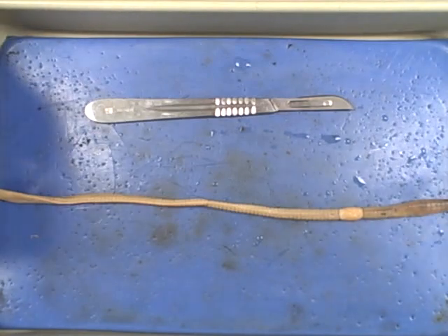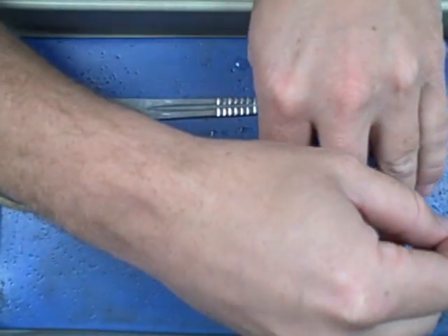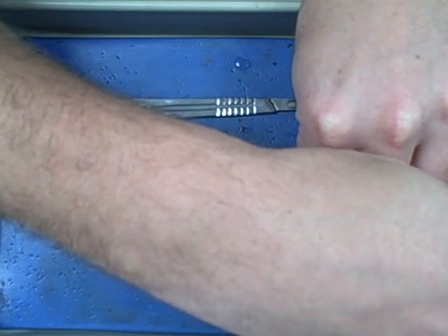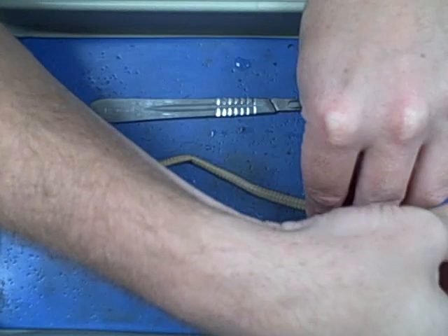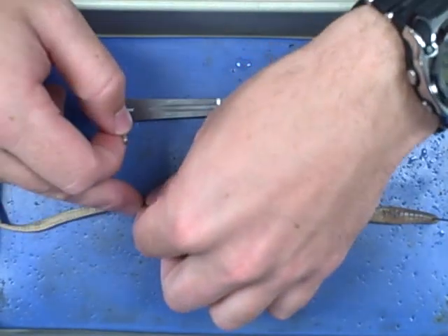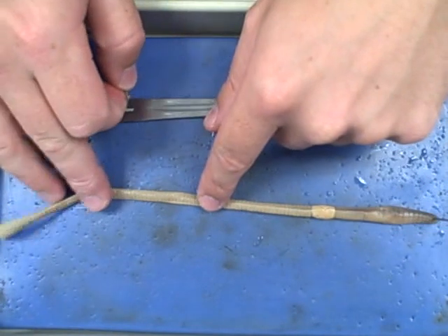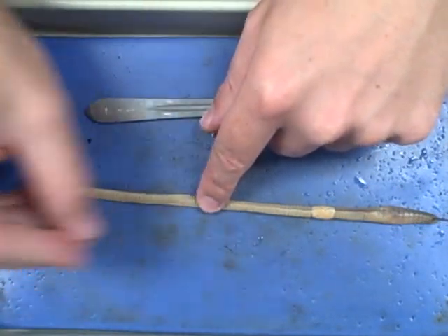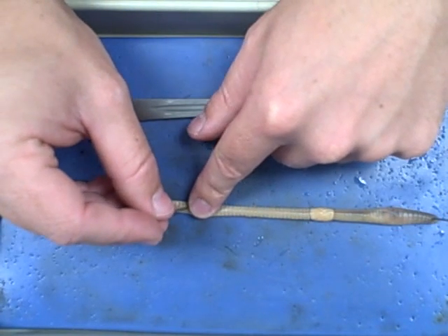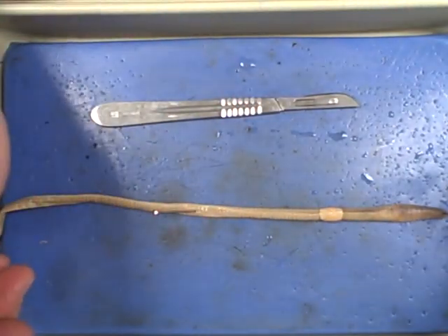To start the dissection, take one pin and place it about the second or third segment of the worm and pin it down. Take another pin and go about middle of the way through, because the worm may actually be longer than your dissecting tray and we don't need to cut all the way down. You don't want it really, really tight, but you do want it tight — it makes the incisions a lot easier. Putting the pins in at an angle also helps keep it tight.